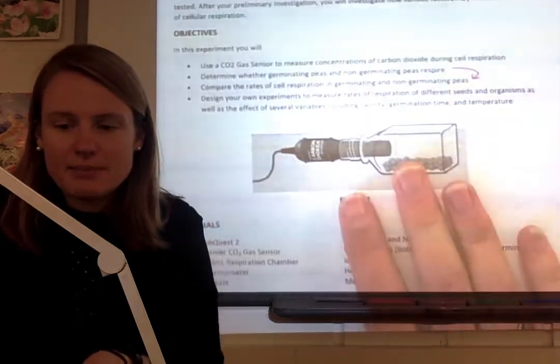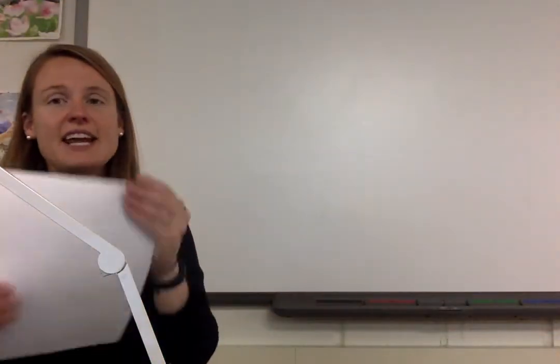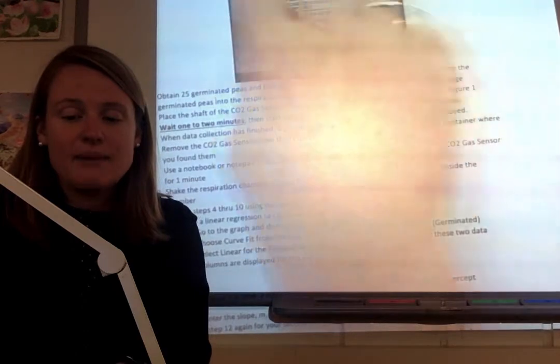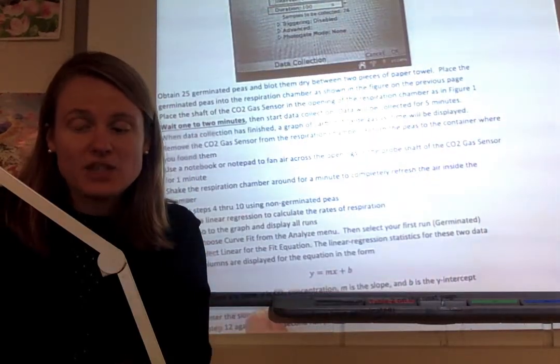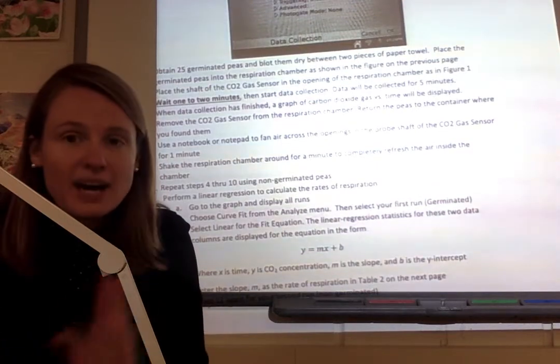Okay, back to the protocol. All of the materials are listed here. And like I said, I want you to read all of this. Read and annotate, okay? So that you know what to anticipate, so you know timing, so you know what's going in where, how to measure what.